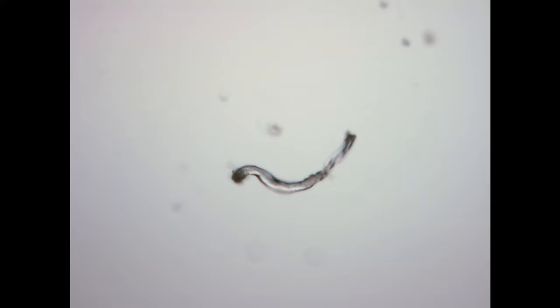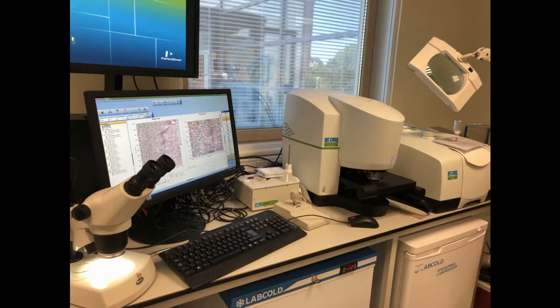These had quite a distinct morphology, so they were very uniform throughout their length. They almost looked cylindrical as well, and they looked very different to the plant-based stuff. So I was able to use infrared spectroscopy in order to characterise the composition of these different types of fibres that I was finding under the light microscope.